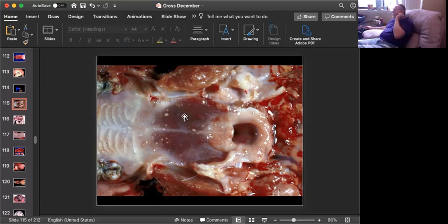So the morphologic diagnosis is multifocal to coalescing, necrotizing tonsillitis, or multifocal tonsillar necrosis, and some great causes. Viruses that will cause necrosis in the tonsils, probably the most important is going to be classical swine fever, but you can also see this in young pigs with pseudorabies disease or suid herpes virus type 1, also known as Aujeszky's disease in Europe. You can see it with porcine circovirus type 2 or the arterivirus that causes porcine reproductive and respiratory syndrome, or PRRS.